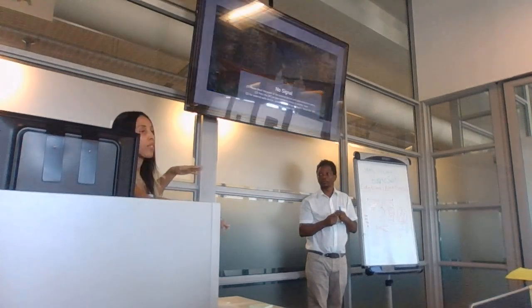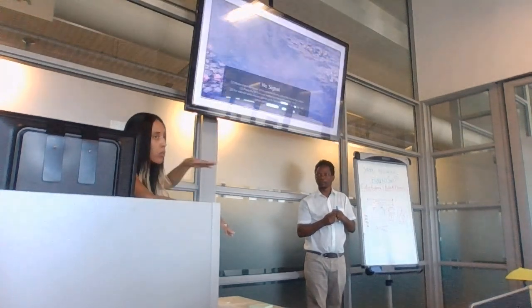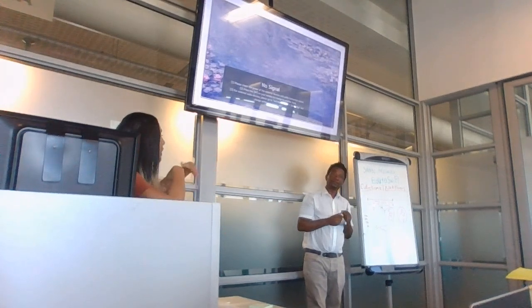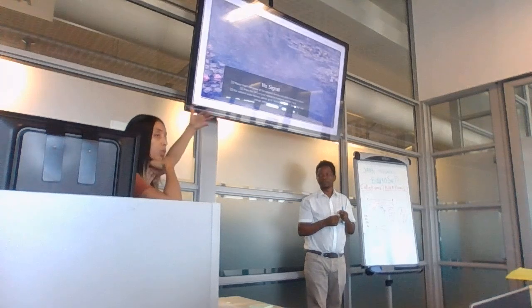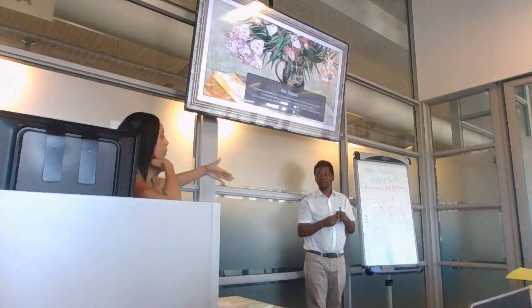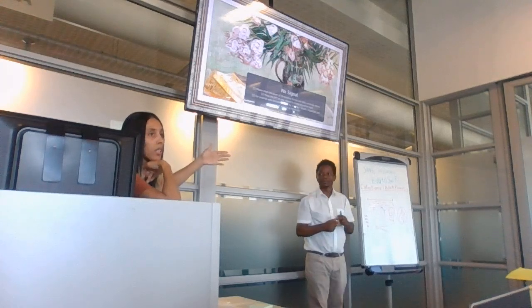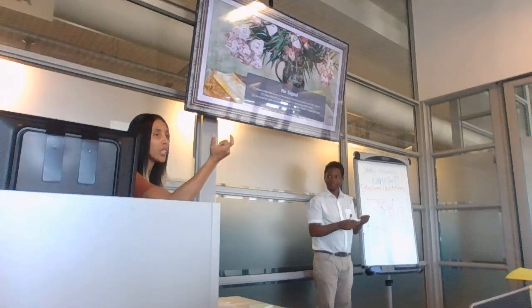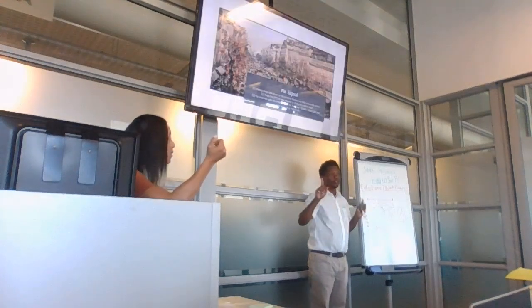Whether it's forward or reverse, you will span most of the genome, and they will have overlapping sections. So you can feed it back into the original reference genome, and it should still be able to give you hits. Remember, we used to do it with even short sections, and now we're doing the whole genome. Yeah, she's correct.